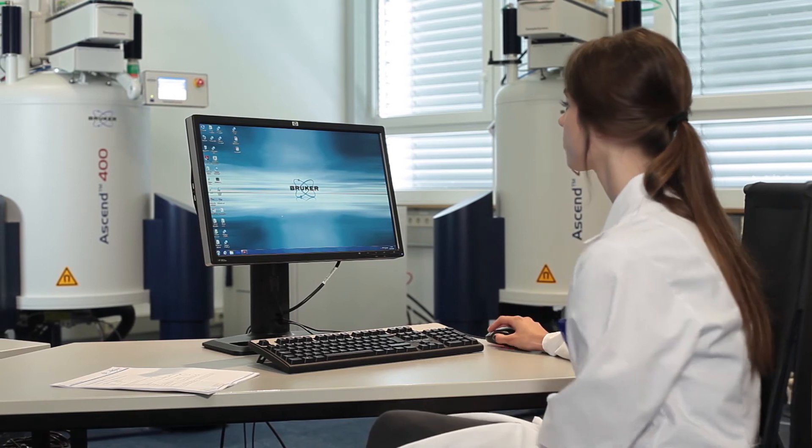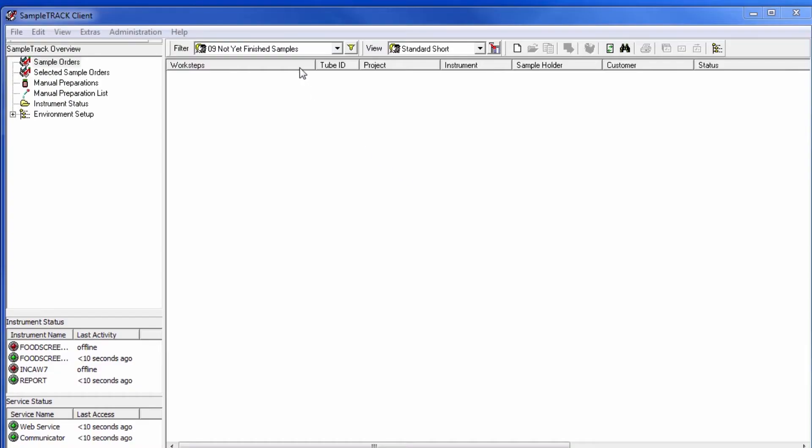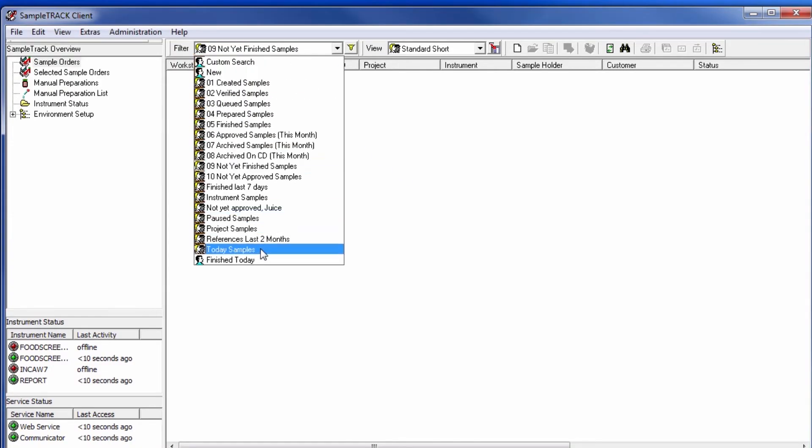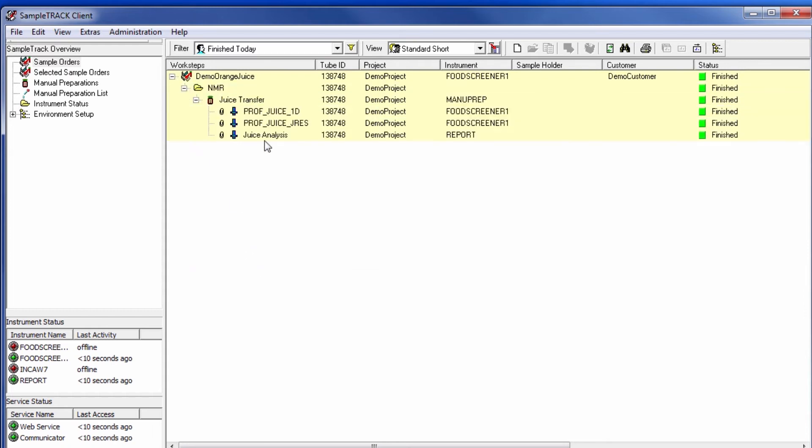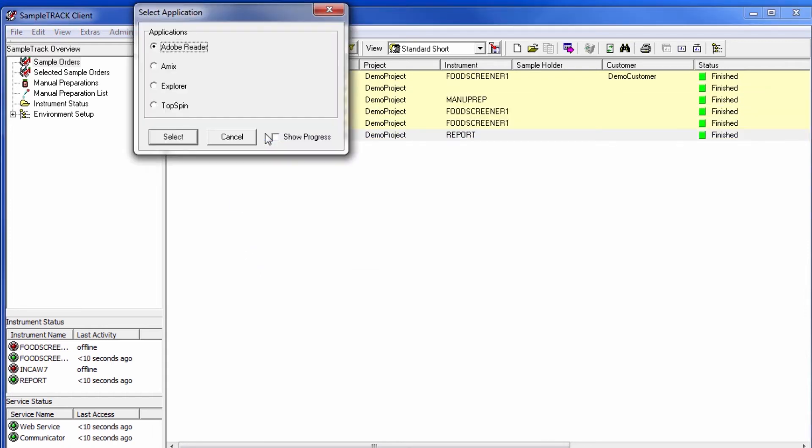A comprehensive database of validated samples is used for the result generation. The status of all samples is accessible at any time, also remote through the web.